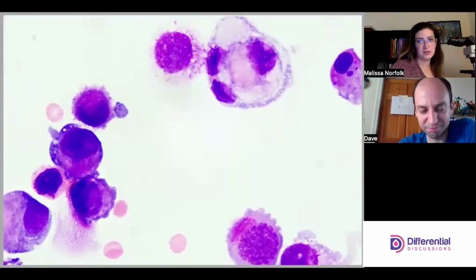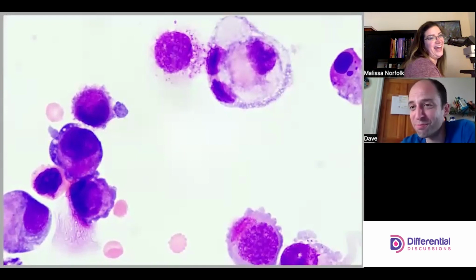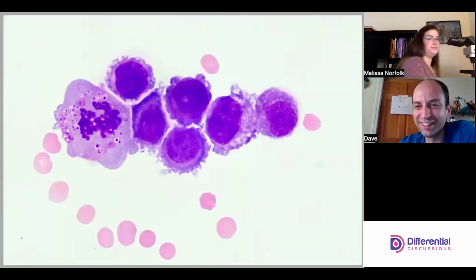That wouldn't be surprising. Yikes. I want to believe that this is a macrophage that's eating the cancer. Good job. Fighting the good fight. But it's a losing battle.